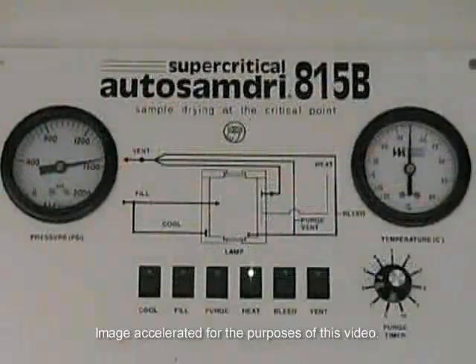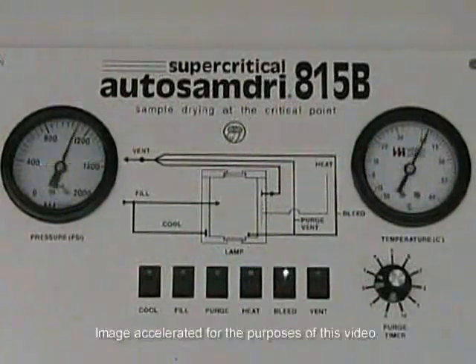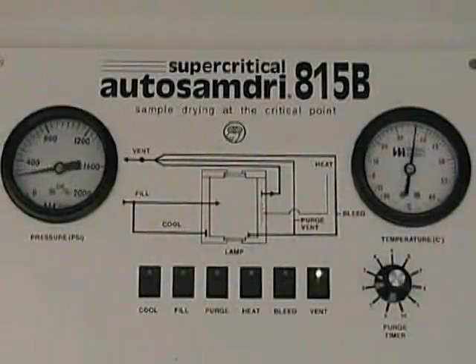As the temperature achieves 31 degrees Celsius, the unit will reach the critical point. This is where the Tussemi's equilibrium 4-minute cycle starts — the heat LED will begin to blink for the next 4 minutes. At the end of this period, the 815B will automatically advance into the bleed mode; the heat LED stops blinking while the bleed LED starts. Somewhere between 360 and 400 PSI, the unit advances from bleed mode into vent mode, and the chamber comes to atmospheric pressure in approximately 10 minutes.